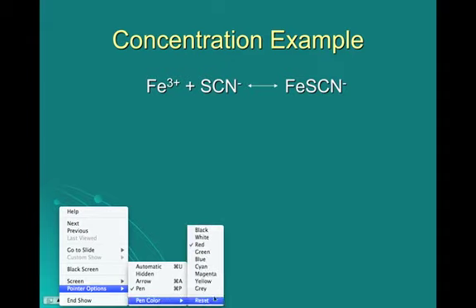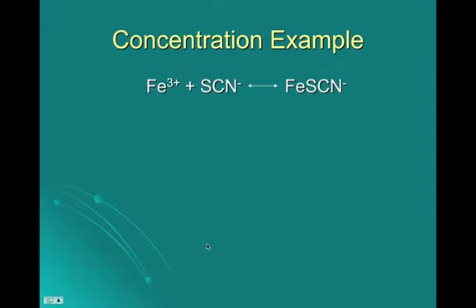Go back to white here. There are three different things that we're going to do to this. The first thing is we're going to add iron, in the form of iron nitrate. This will ionize into the iron ion and the nitrate, and that's going to increase the concentration of this. So increasing that means that we are going to shift away from what was added, and what you will actually see is this iron thiocyanate complex is a really deep, very dark red.